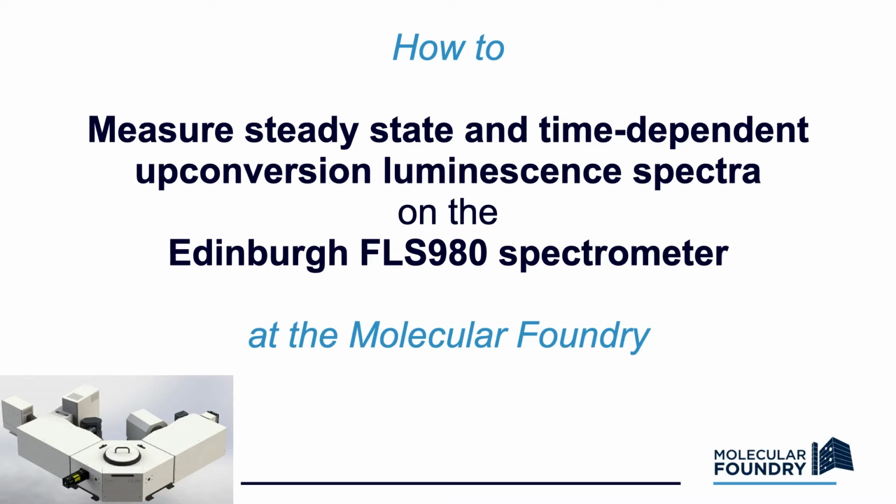This video will show you how to measure steady-state and time-dependent upconversion luminescence spectra on the Edinburgh FLS980 spectrometer at the Molecular Foundry. This tutorial is intended for first-time users that are being trained on the instrument at the Foundry. The idea is that you would follow along with the video while you're sitting at the instrument performing your own measurements. While the operations here are specific to the Foundry, these instructions may be useful for users of other Edinburgh FLS spectrometers.